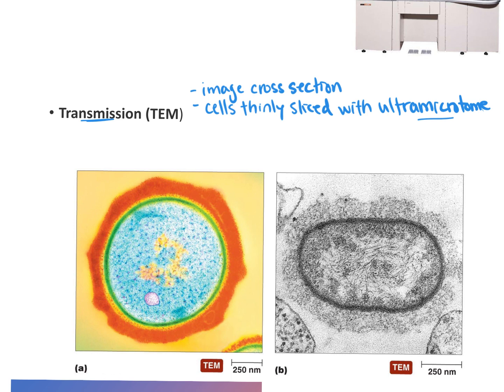And it's potentially pretty problematic. I've heard of researchers spending a month trying to get a good picture of their cells, to publish. It's quite a process to prepare the cells. They have to be dehydrated, embedded in plastic, and put on a copper grid. So sometimes the image that you see can be a little bit distorted, and it takes a lot of practice or some specialization to be able to understand exactly what you're looking at.